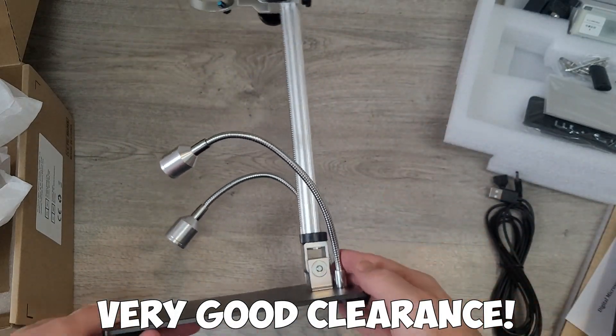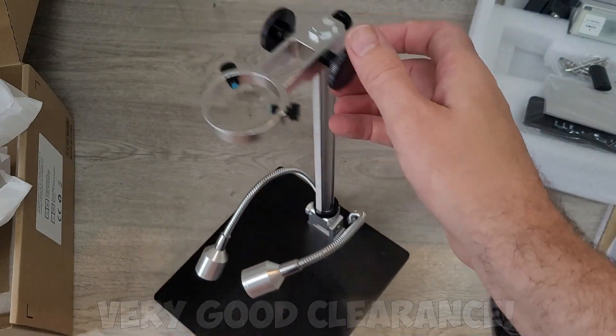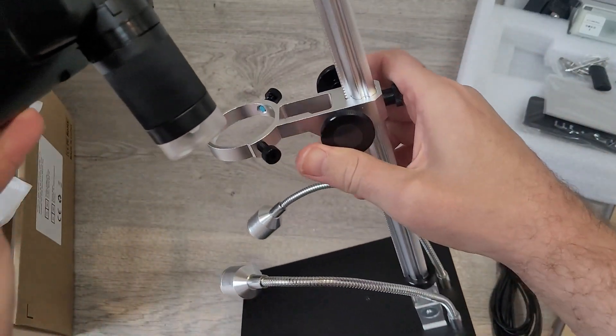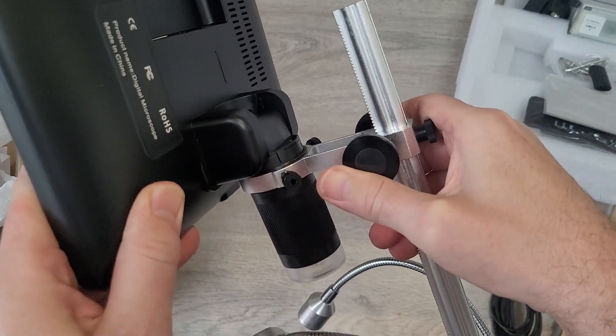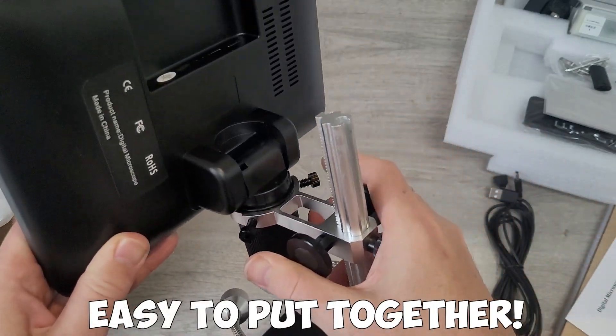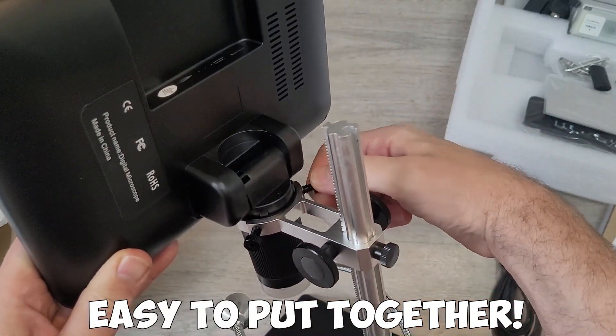The rear stand is a really good height, so you're going to have a lot of clearance to put pretty much anything underneath. You then simply slot the microscope into place, and there are two screws on the back which you tighten to stop the microscope screen from moving.